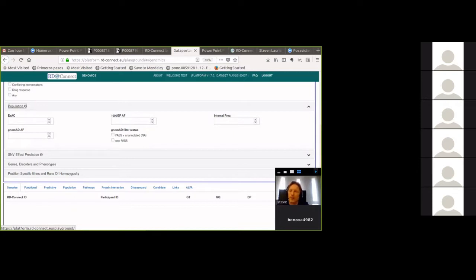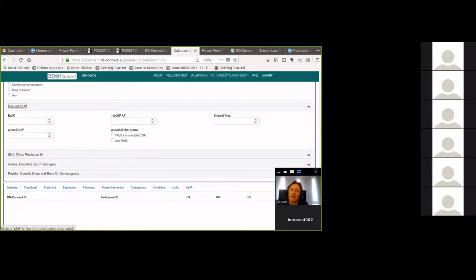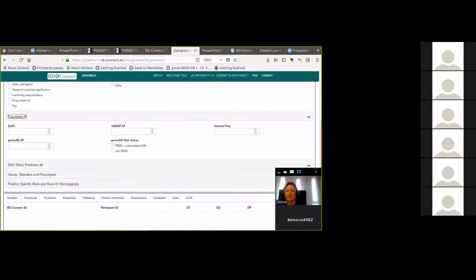The next filter is population frequency. Since we're looking at rare diseases, applying commonly used control population datasets is a very useful filter, done by allele frequency — a value between 0 and 1. We have data from ExAC and gnomAD, which is like ExAC but larger, plus 1000 Genomes population data. The platform also has internal frequency data, but we won't use that today as our test set is only 15 samples — not a useful frequency for filtering.